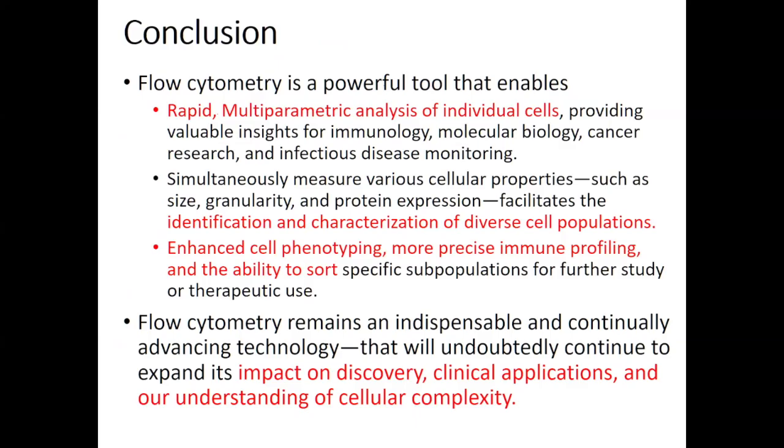Right? To conclude, it's a powerful tool that enables rapid, multi-parametric analysis of individual cells. One beauty of flow is rapidity. You give the sample in the morning, I can give you the report in the evening. Whereas with other assays like NGS and molecular, I don't think it's possible. And one more beauty of flow is it's a cell analysis. You are analyzing an intact cell. You are not taking anything out of the cell.